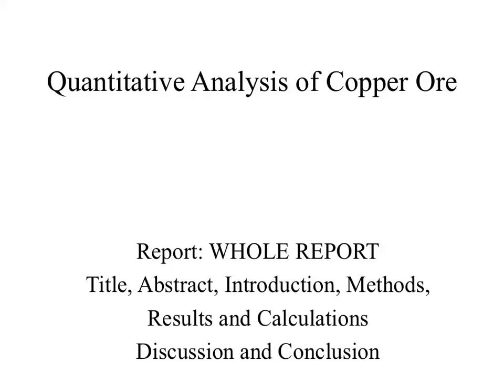Bless you. So it's going to be the quantitative analysis of copper ore. You're going to get an unknown copper sample from the stockroom, and then you're going to process that sample in a couple different methods to try and determine the composition of the copper ore. This experiment is going to be done individually all the way through, just because it's more fun to do it that way. Okay?